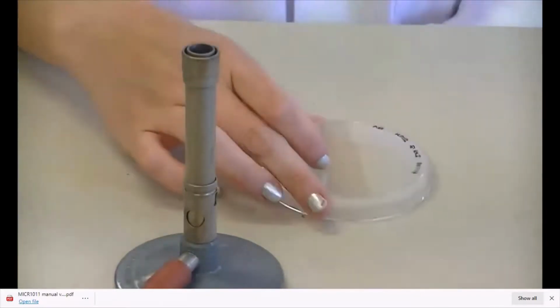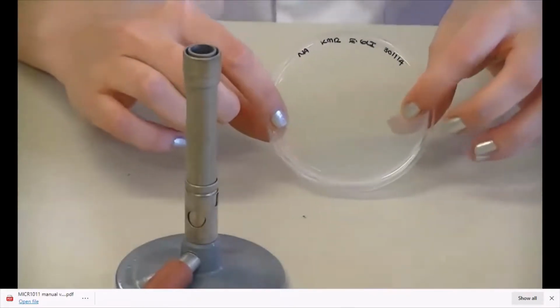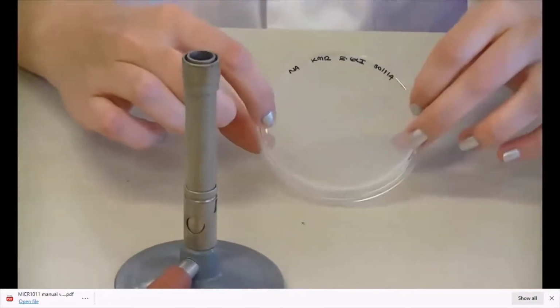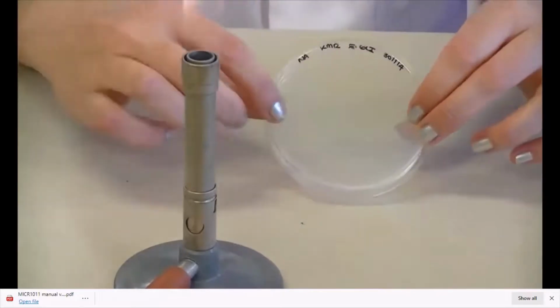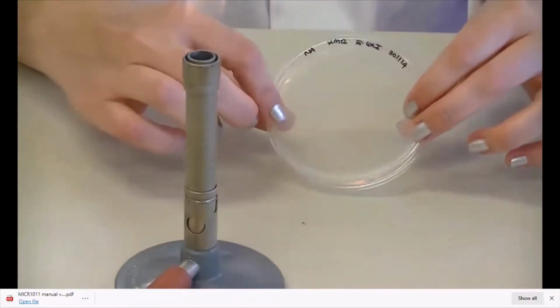You should always label your plate on the bottom of the plate, just in case the lid is lost in transit or is removed from the plate. So you would always label it on the bottom, and you also need to label it on the edge or the circumference of the plate, so it doesn't obstruct the view of what is growing on your plate.